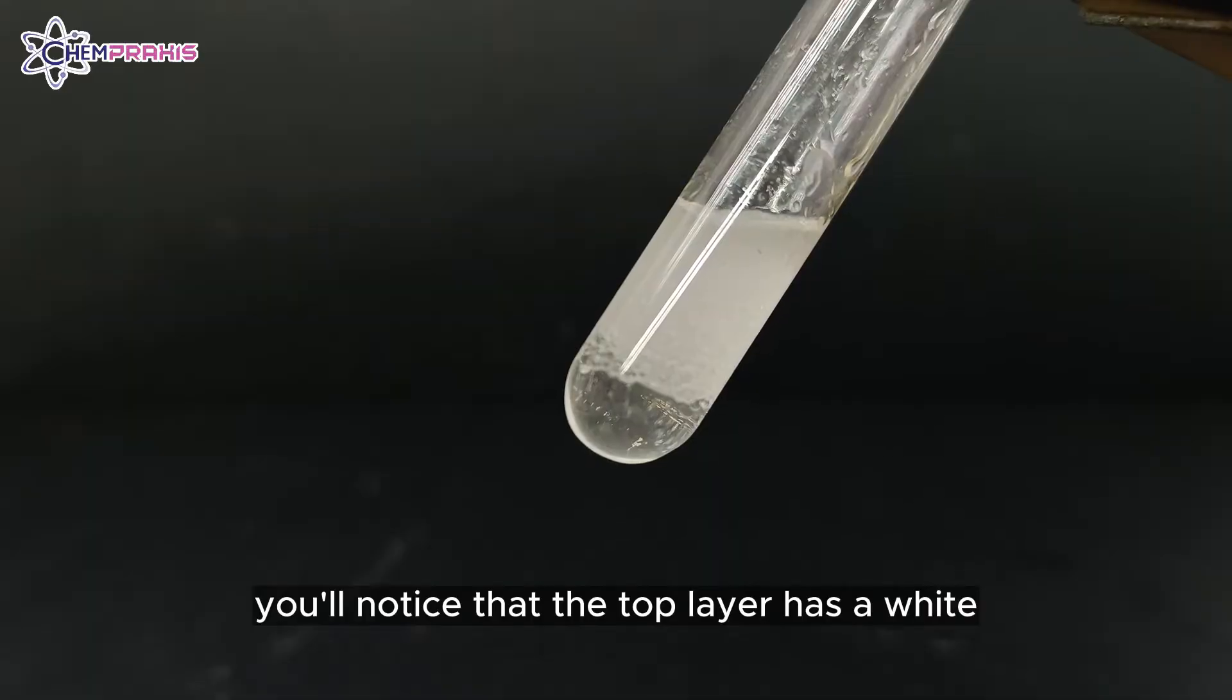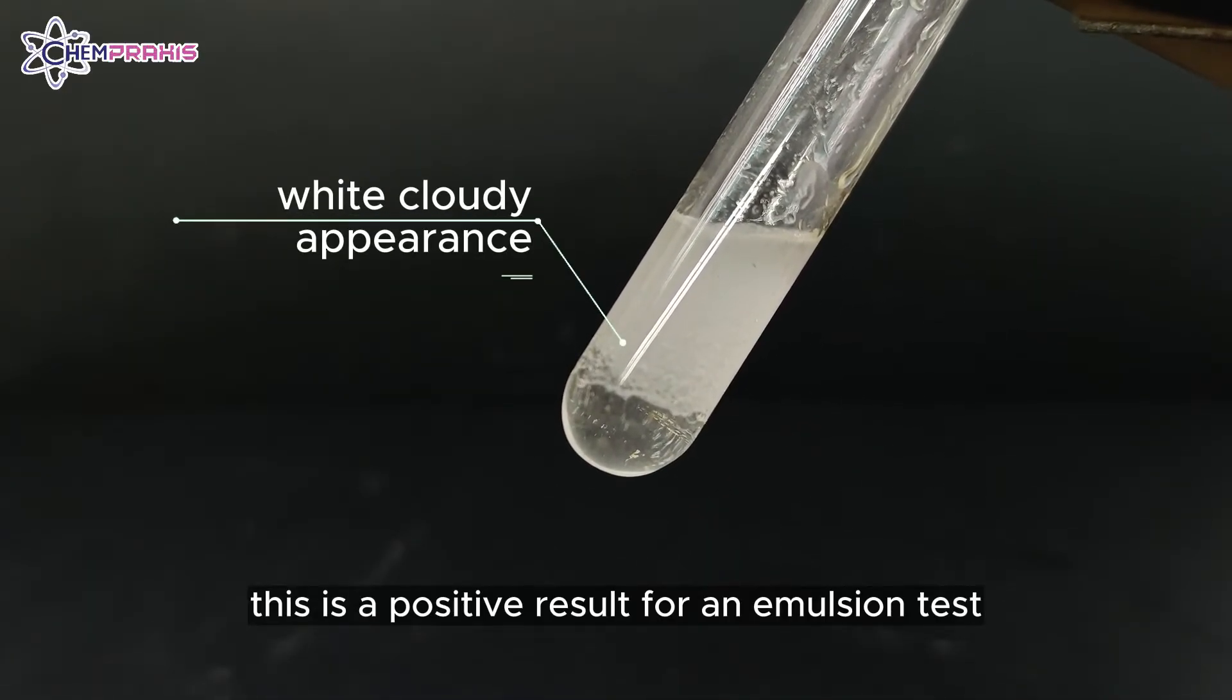You'll notice that the top layer has a white cloudy appearance. This is a positive result for an emulsion test.